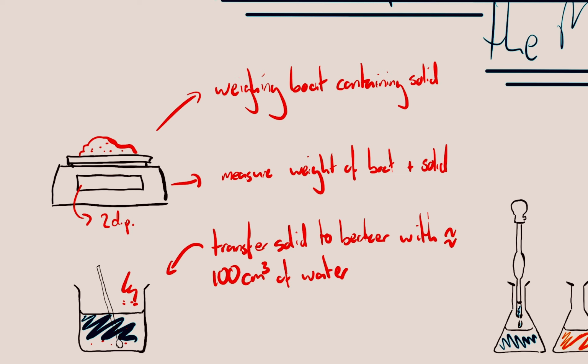And once we do that, we're going to re-weigh our weighing boats. So at that point, our weight of solid is going to be very precise.